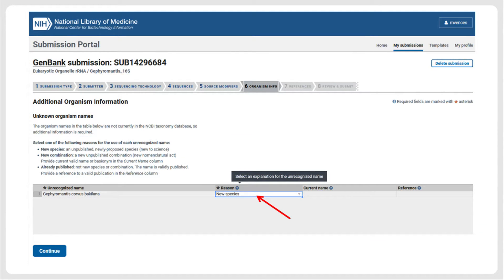In the next step, we can specify that the unrecognized name refers to a new species, an option that also includes new subspecies, as in our example.